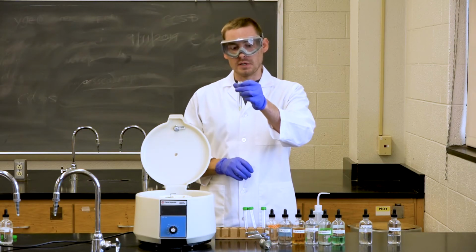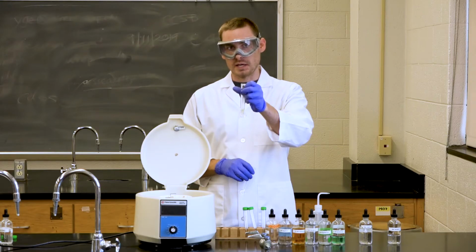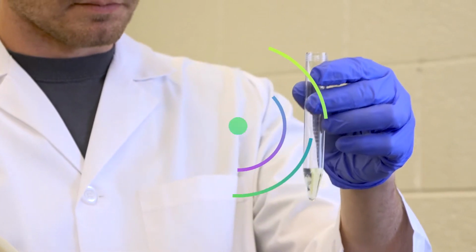As you can see in this one, the solid has been forced to the bottom and to the side. This will allow us to separate it and then continue with our experiment. If you still see white precipitate floating around in the liquid, you can centrifuge it for longer, or again, try not to disturb it because it may move around and be resuspended in your test tube.